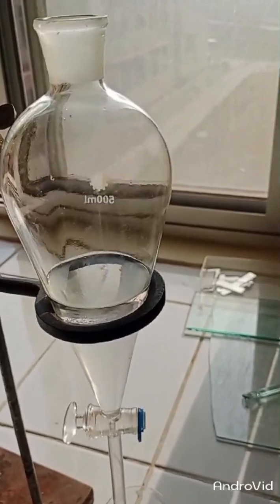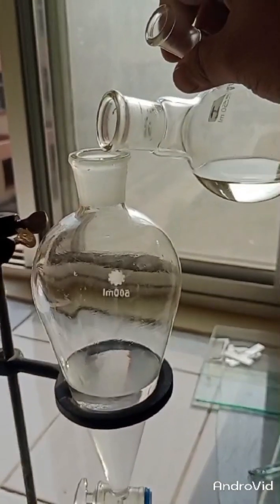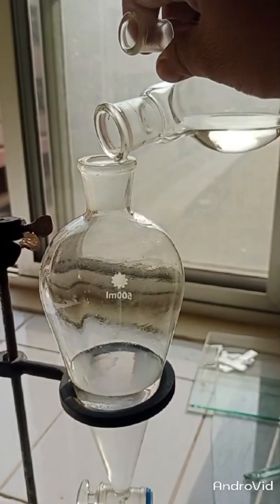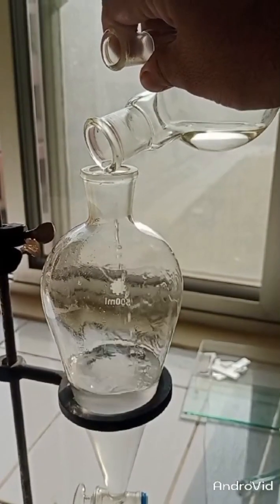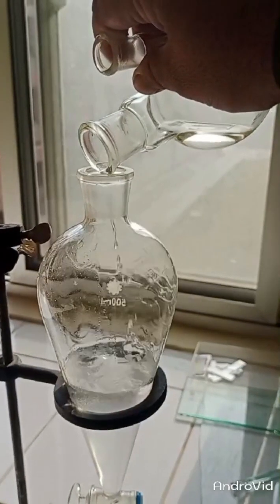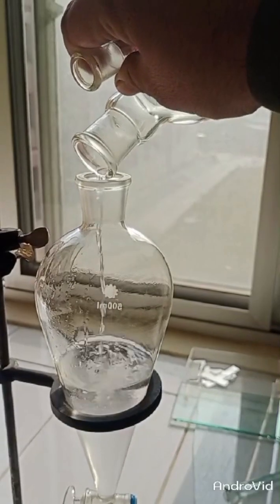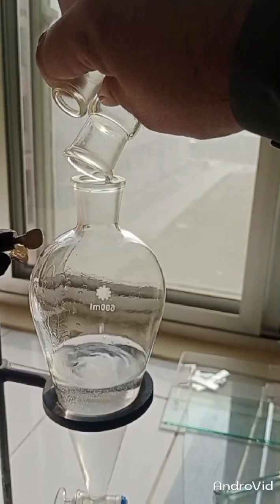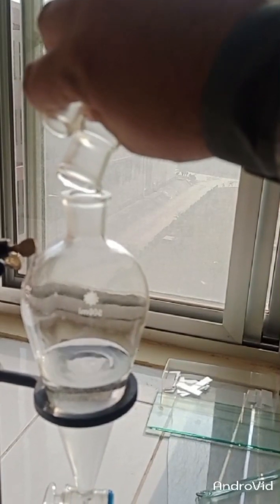All the organic components will be collected in the layer present at the upper surface. Now in the next step, I am going to add my product into this separating funnel. Add it carefully so that your product is not wasted — make sure all the product is poured into the separating funnel.